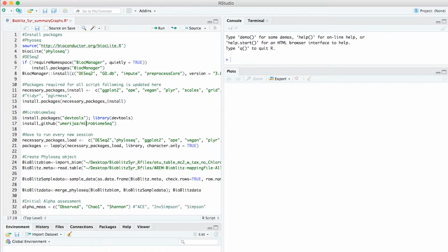When you're doing a project for microbiomes around the built environment or any specific project, there's a lot of data that comes out of the sequencing, and it's using R and down the line Excel that you can get an idea of what the story is in your data. So we're going to work with R today, and the first step with working in R, we're going to talk about the basics and a lot of the packages that are going to be facilitating your analysis.